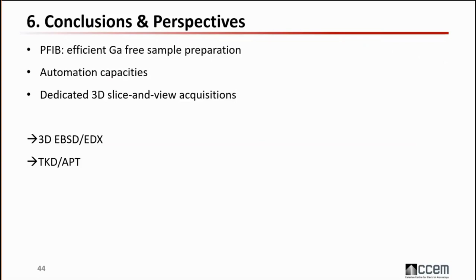And as I showed at the end, I hope I have convinced you that this PFIB is also a very dedicated 3D slicing and view acquisition tool. We can get a very good quality 3D volume because of the very good stability of the system, and also the very high resolution of the SEM imaging. Concerning the perspective, since we are going to install the Oxford Instruments EBSD detectors in January, we are going to have access to experiments like 3D EBSD and 3D EDX.